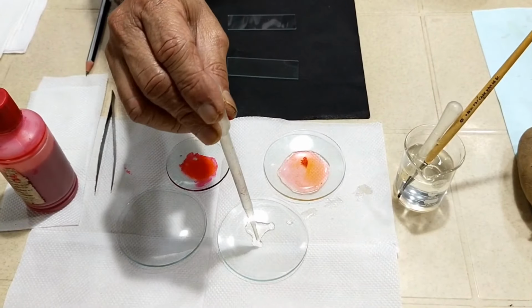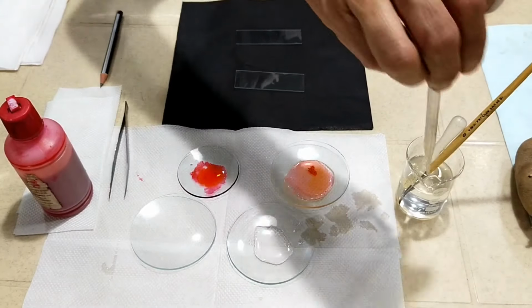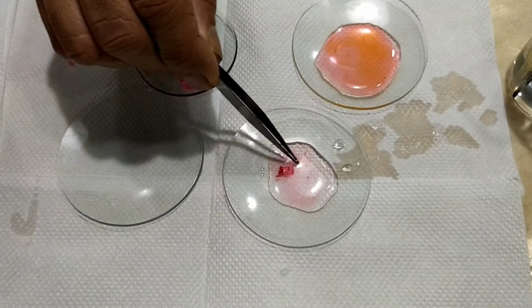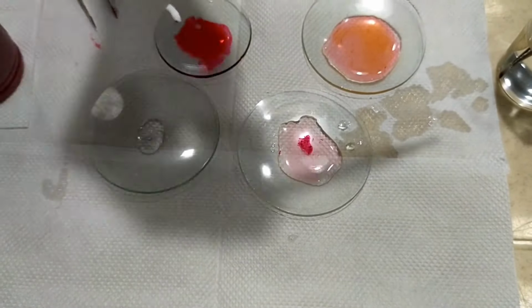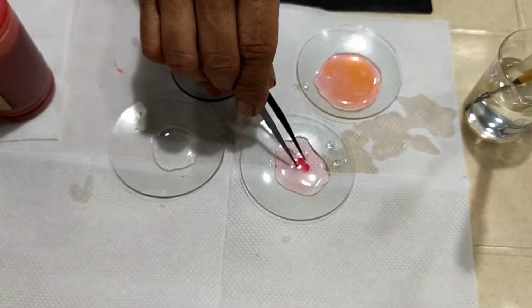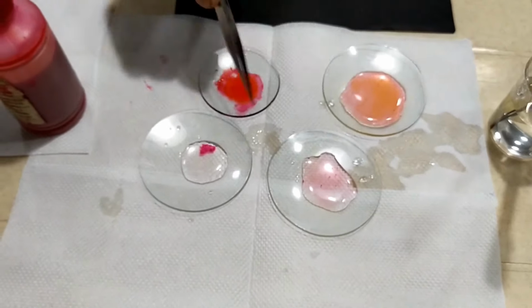I'll take some more water in these watch glasses, and then I will try to shift this skin piece there, and you'll find that all the extra stain is being removed. In fact, I can take some more water and allow the removal of the stain. Okay, watch here. It seems that now the extra stain has been removed.